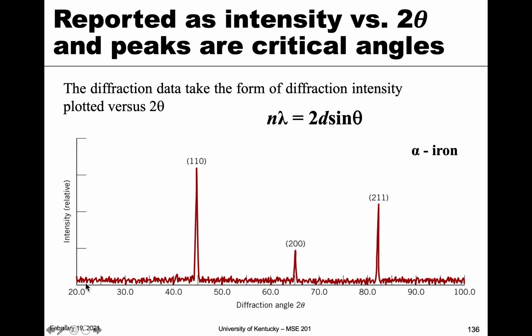So that keeps going, and we start at 20, and then we keep scanning to record this data, and we go up to 30 and 40, and we keep scanning, and nothing's really happened yet, right? It just looks like a very ragged line. So nothing's happened. However, once we get here, about 45, you see that the intensity shoots up, right? And actually forms a peak and then comes down. So it's a very narrow peak that we see here. And then it keeps going, nothing happens, and we see another peak in intensity, and then another peak of intensity.